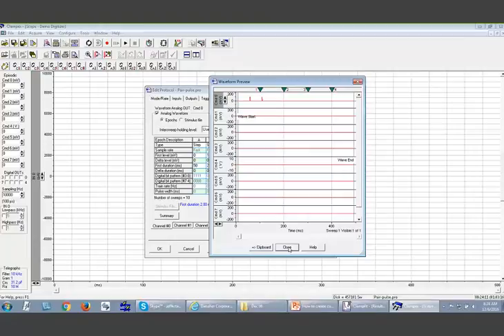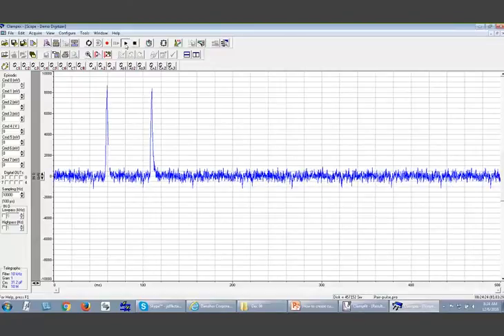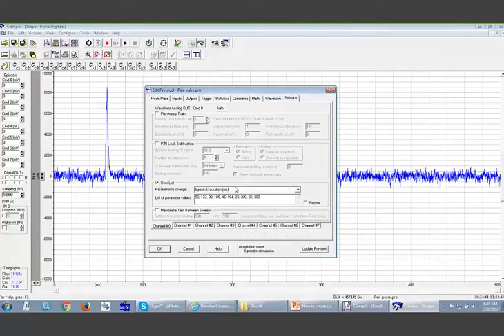Now, in order to change the pulse interval, let's do something here first. Hit OK. Then you can see that it's 50 milliseconds apart. Now, I want to change this duration so that you can monitor the inter-pulse interval here. Let's say I change it for Epoch C. Now I put a number here, 50, 123, and 30. That is the inter-pulse interval. And I hit OK.